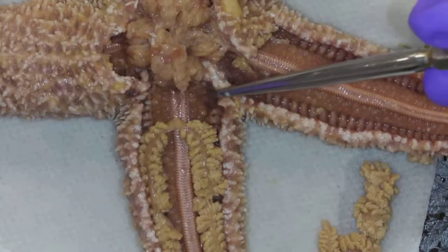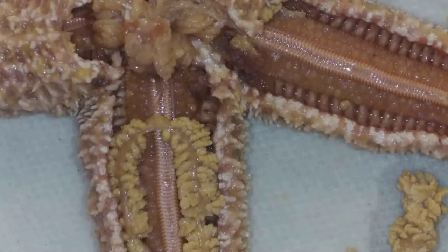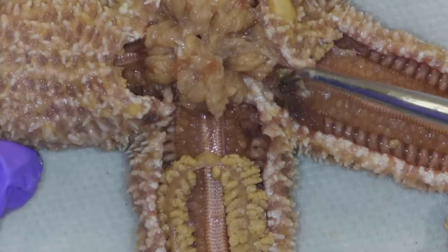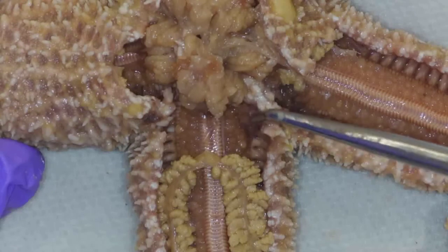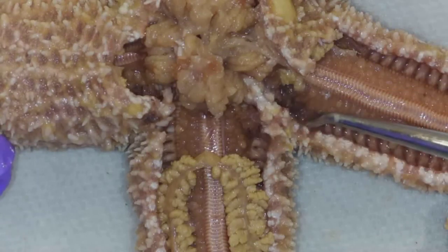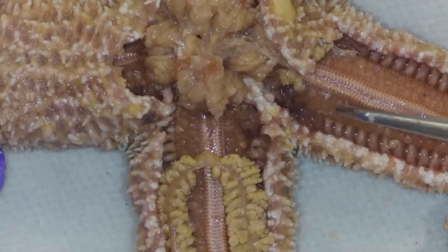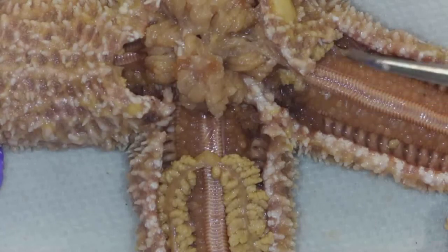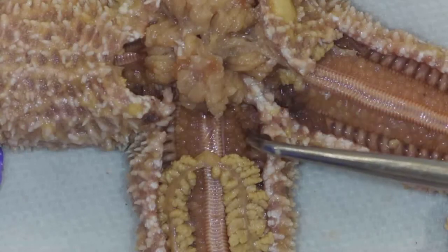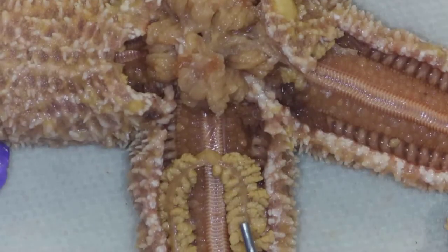Up here in the corner, can you see these little structures right here? They actually look like little clusters of grapes, and they're kind of that red color like everything inside here is. Those little clusters right here — those are the gonads. I can't tell if it's male or female, and the size of the gonads can get larger if it's going to be the season for spawning. Remember, they have external fertilization, so they're going to release eggs or sperm into the water.